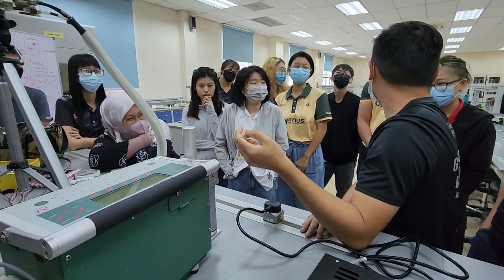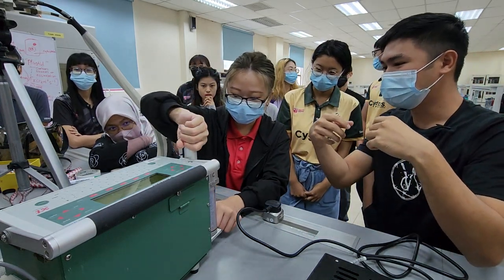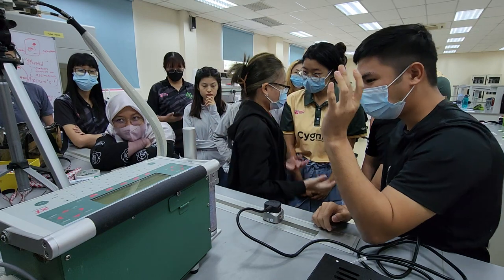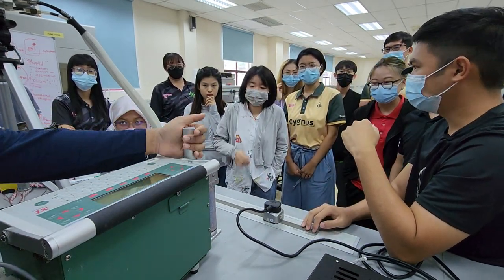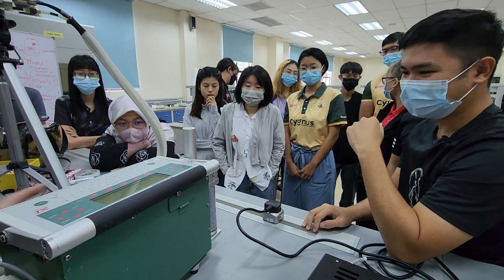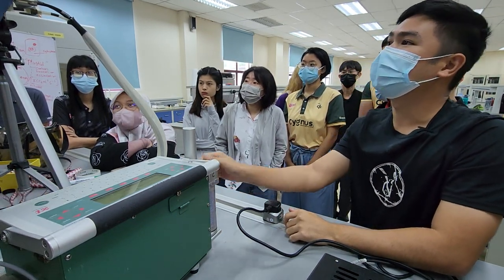Anyone want to do it? Try. Twist it faster. Okay, does that sound right? How do you know whether it's leaking or not? If it's leaking, it's going to be super cold. If it's not cold, then this is normal. It's good. All good?